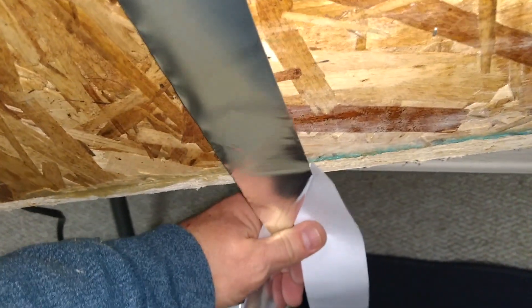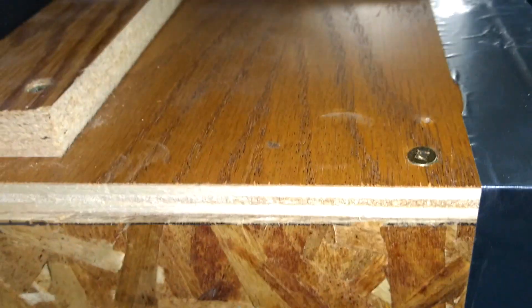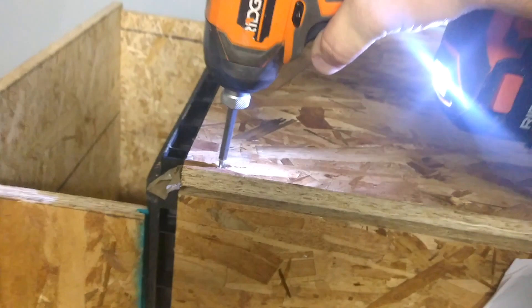Cover all the cracks with this tin tape that's used for ducting. And it works quite well. And that's basically my design.